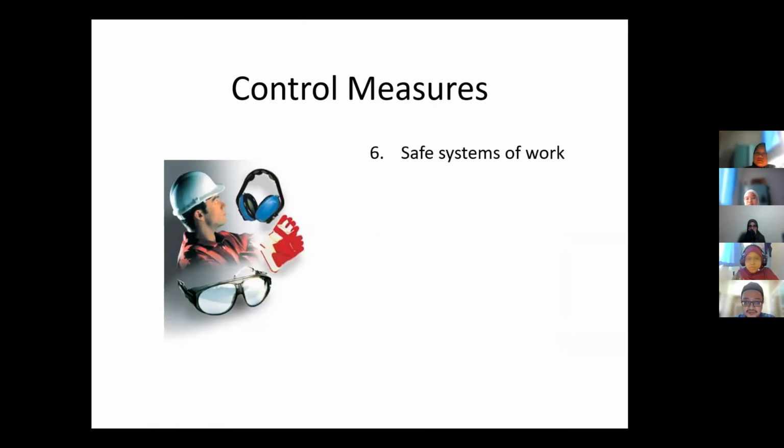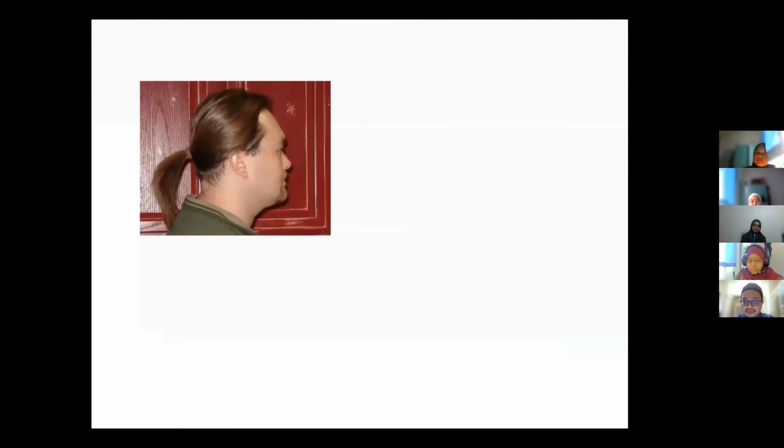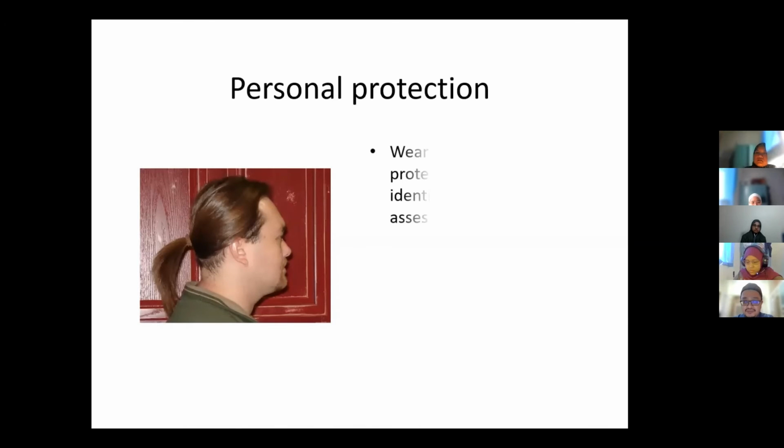Okay. We must have also safe systems of work, reduce exposure time, increase distance, reduce volumes, and wear PPE, personal protective equipment. Okay. So wear the clothing and protective wear as identified in the risk assessment. Adakah gambar ini menggambarkan seseorang yang akan lulus dalam risk assessment? Tak, kenapa?